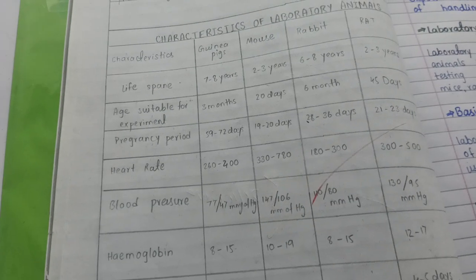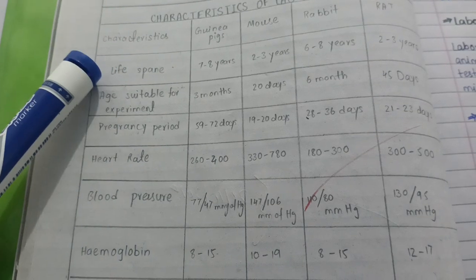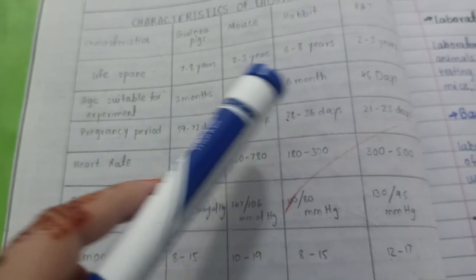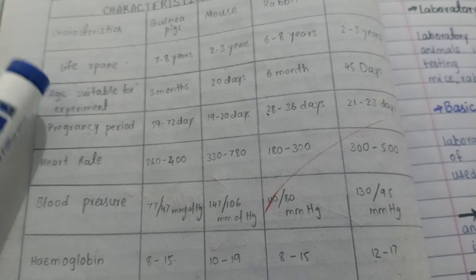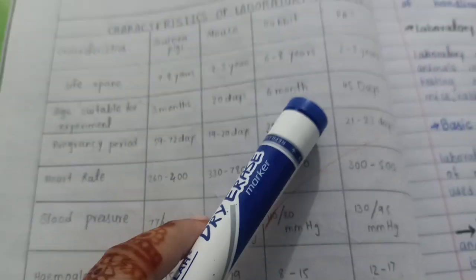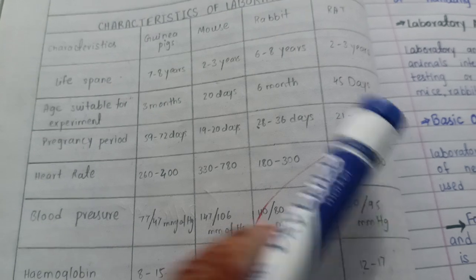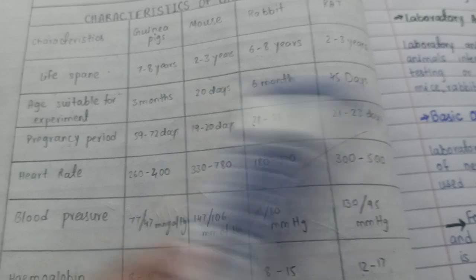Okay, so these are some ways by which you can handle all the animals. Here some information about all these lab animals is given, including their lifespan. Mostly guinea pigs and rabbits closely resemble each other, and mouse and rat closely resemble each other. According to their lifespan, you can see the age suitable for their experiments. Months are used for rabbit and guinea pig, 3 to 6 months, and half is 3 months. For rat and mouse you will use days, 45 days, and the half is 20 days. So you can remember it.